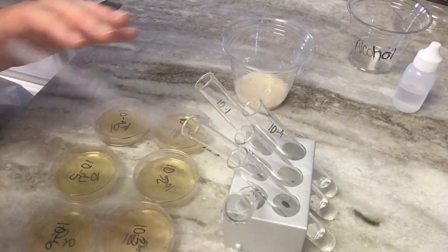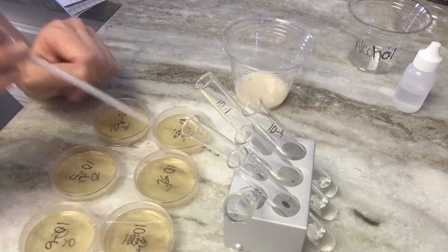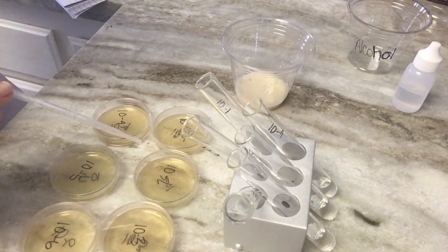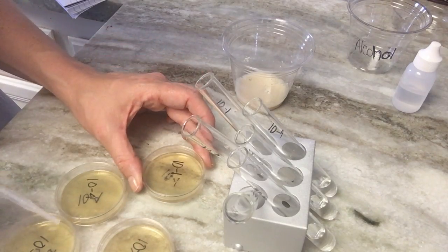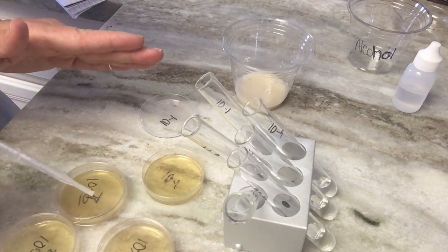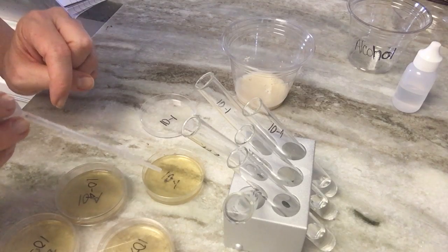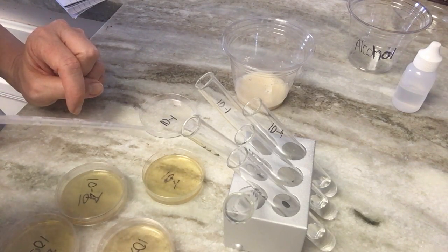So now that we did all that, I decided to start the agar process with you so you can observe me. I do have my mask on, so I'm not breathing too hard and exposing my germs. So what we do next is I'm going to take 10-1, uncover it. I know I don't have my gloves on right now. I did wash my hands very, very thoroughly. So here we are having an error already. I will confess to that.